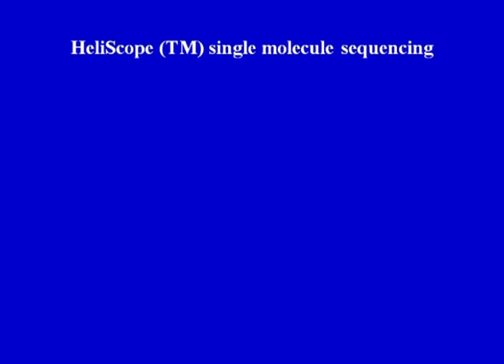One is Heliscope single molecule sequencing. The first single molecule sequencing machine was developed by Helicos. This platform uses individual DNA fragments that have been tailed with poly dA and then annealed to a slide containing a lawn of oligo dT primers. The slide is then sequentially exposed to each of the 4 bases and imaged to determine which DNA fragments have incorporated a specific nucleotide. This machine produces very short sequence reads, but on hundreds of millions of templates, yielding multiple gigabases of DNA sequence per run.